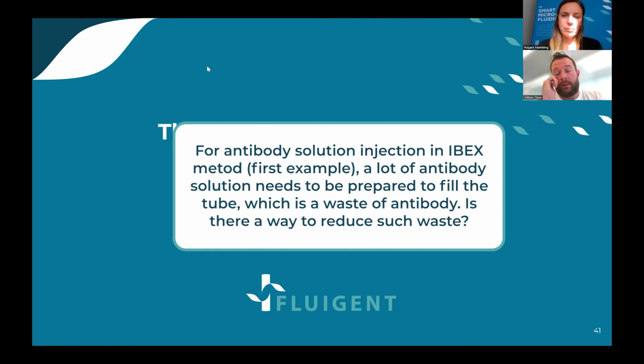So I would say you anyway have to use at least 100 microliter. Yeah. So yeah, this is really the minimum you can work with. Okay. I don't know if it's a lot, if it's too much for you.